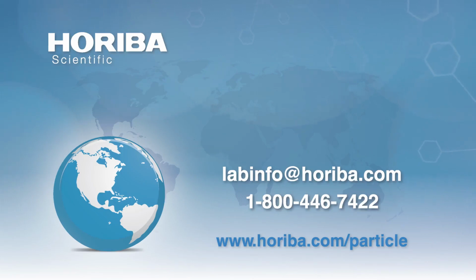I would just be using a refractometer or a density meter, probably based on ultrasonic attenuation of something. But I think there are ways to estimate, and I will send you a paper, and it's based on the weight percentage of each ingredient.